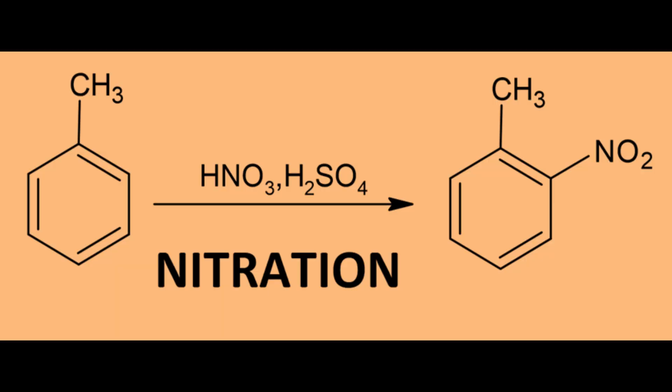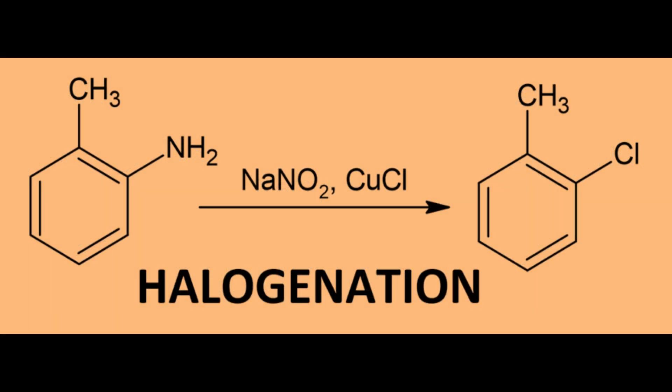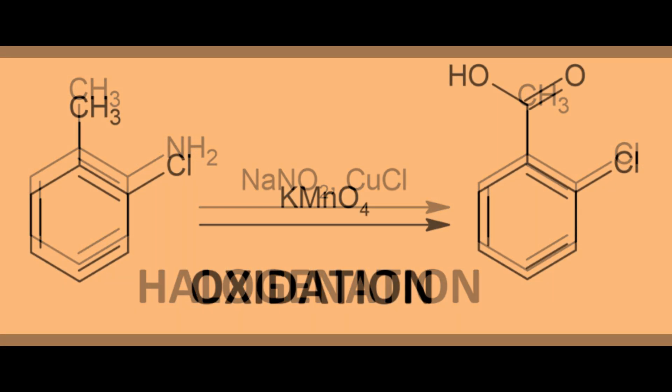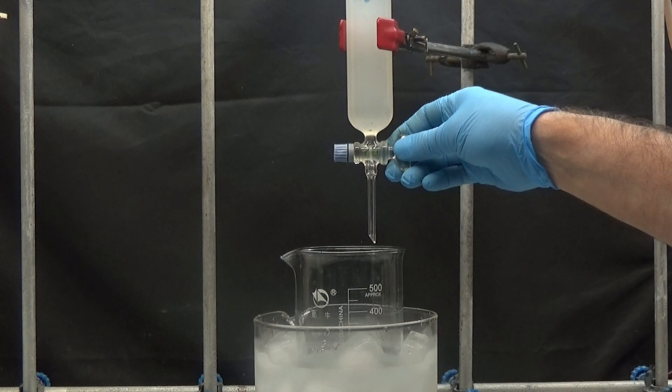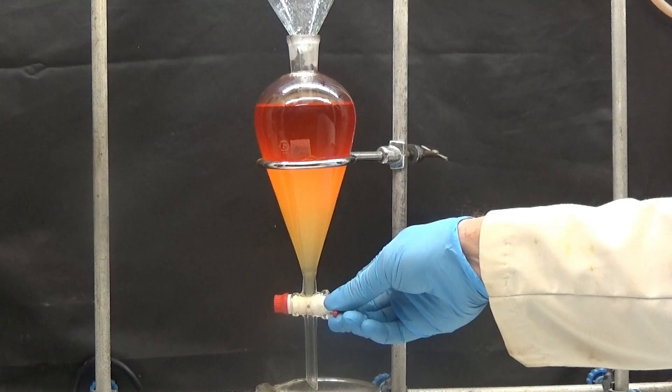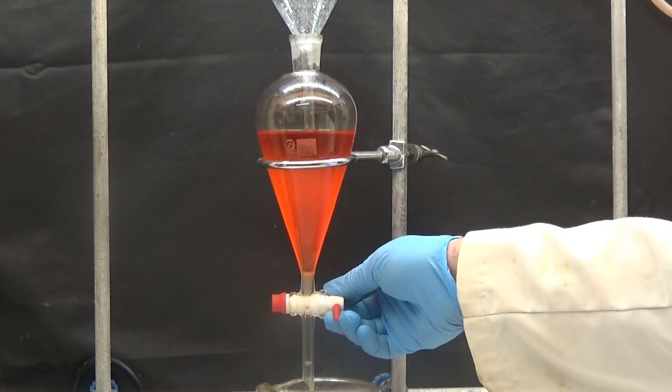The synthesis consists of four steps: nitration, reduction, halogenation by the Sandmeyer reaction, and finally oxidation of the methyl group of toluene. We are going to start nitrating toluene with nitric acid. I cannot show the details of the nitration in the video because YouTube censors me.